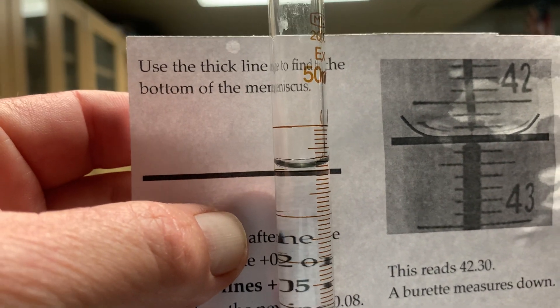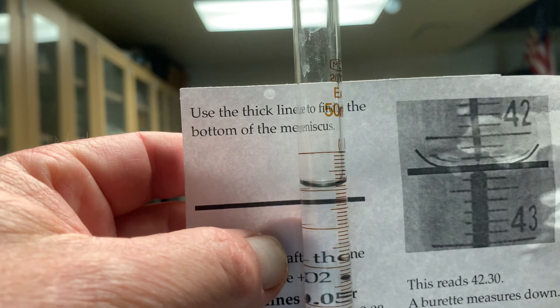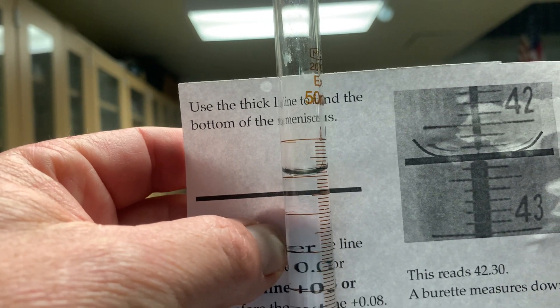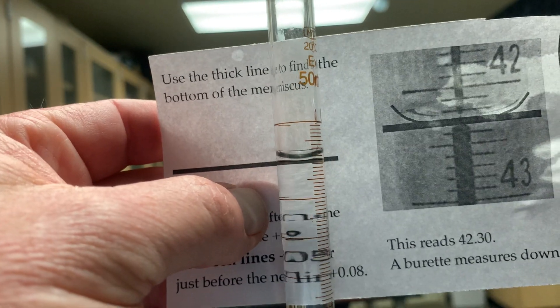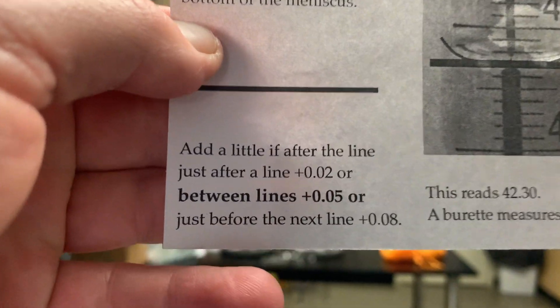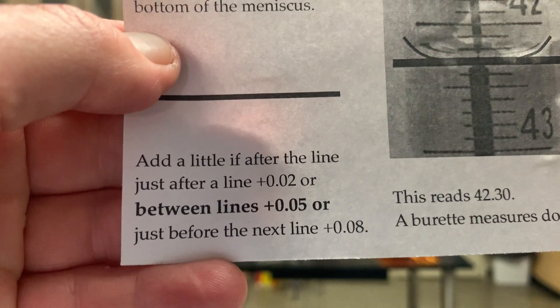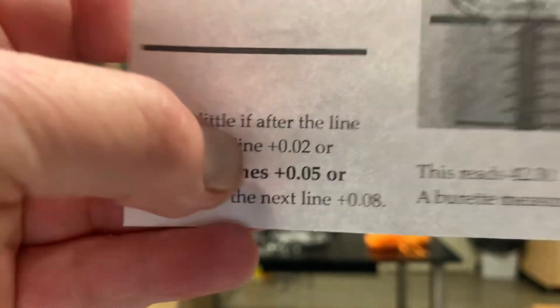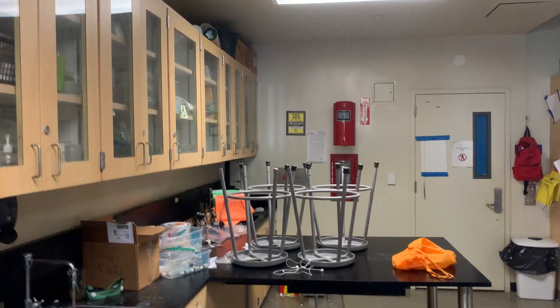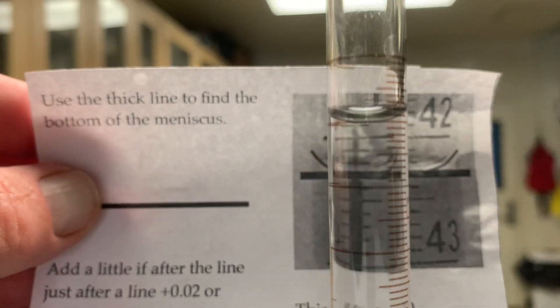The bottom of my line is maybe just above the one but below the nine, so I'd say it's 0.95. The way we read this: if it's a little after the line you say 0.02, if it's between lines you say 0.05, and if it's just before the next line you say 0.08. So I could have chosen 0.05, 0.08, or honestly it's very close to 1.00.